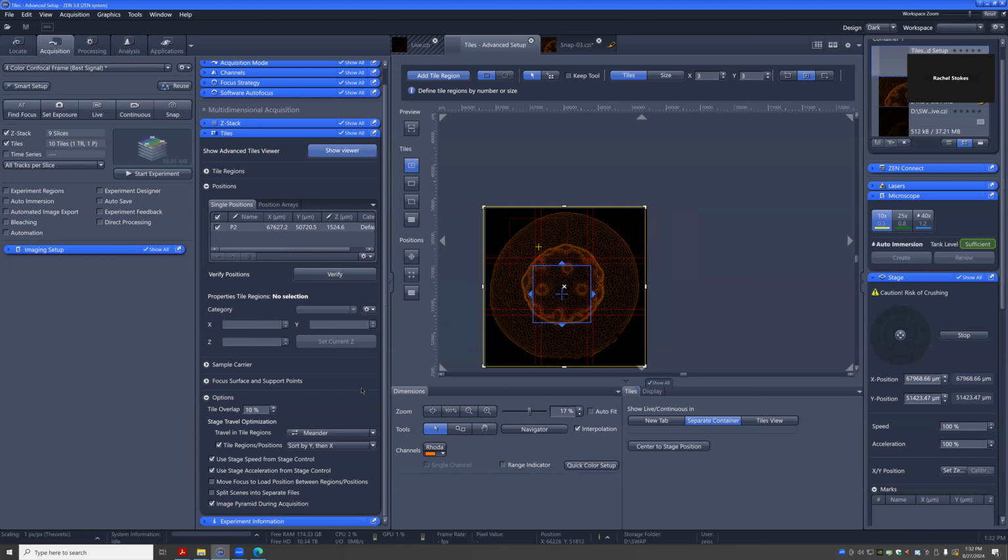Generally on a confocal, the scan field is going to be pretty tight. It's not like with a camera where you'll see more shifts between the tiles and you'll need more stitching. I would still stitch the data, but I wouldn't expect large shifts. If you do see large shifts between the tiles, usually it needs a scanning calibration. But that's good to know.